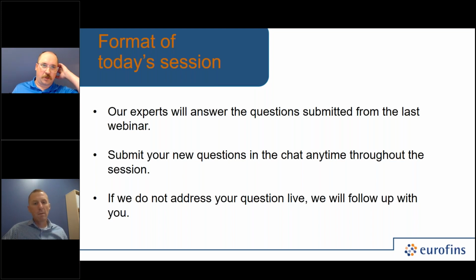Yeah, so typical report, and we run flow cytometry potency evaluations on a routine basis through our routine channels in our laboratory. We will give a live, dead, and injured quantification of the probiotic population of that sample. When we're evaluating spores, it's a little bit different because we don't have as good a separation between the dead and injured cells. So what we end up reporting is a live spore count and a dead/damaged spore count. And that's just based on, again, the same principles of membrane integrity.